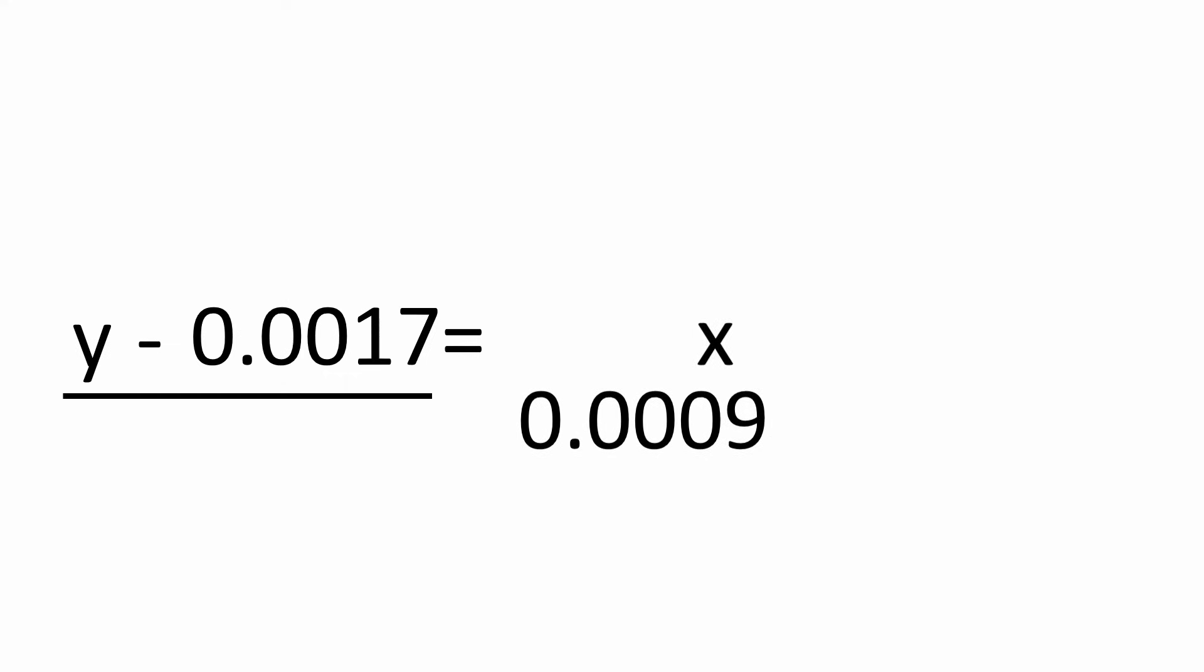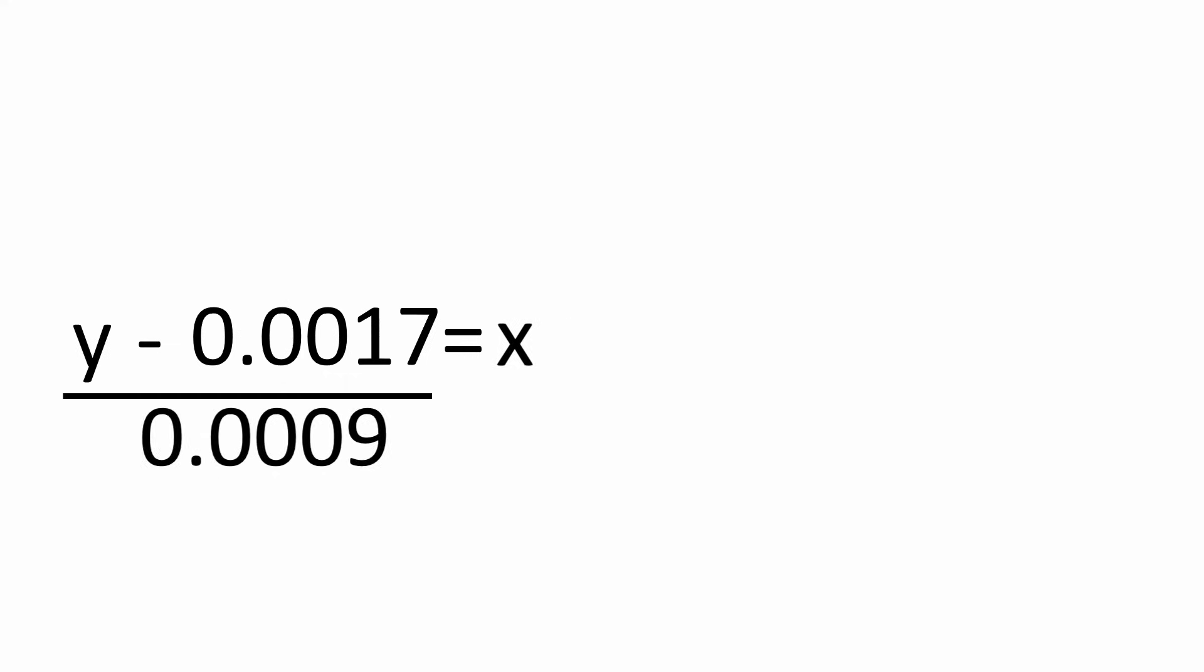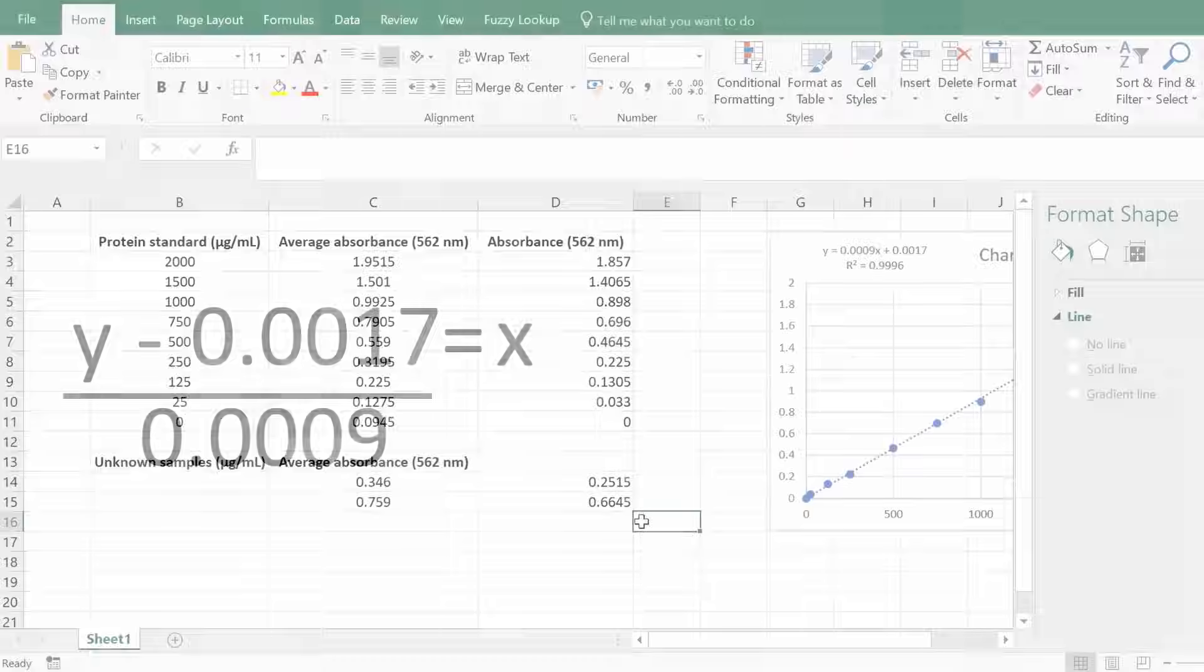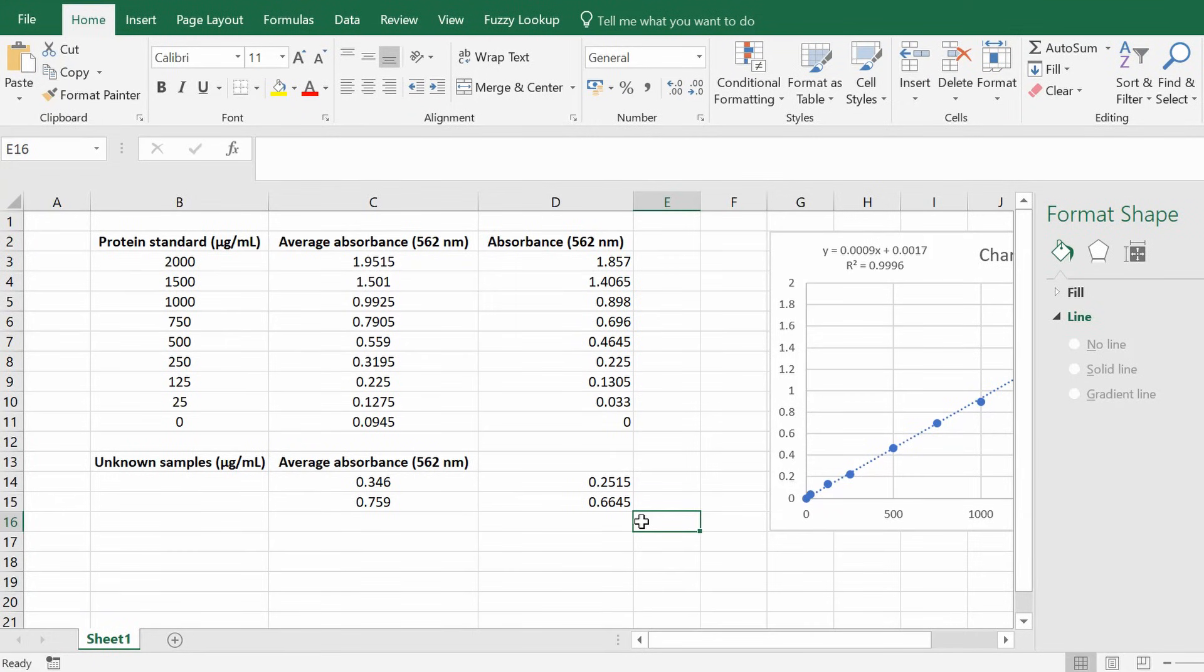To leave us with x which is the concentration equals y which is the absorbance value minus 0.0017 and then divide all of that by 0.0009.